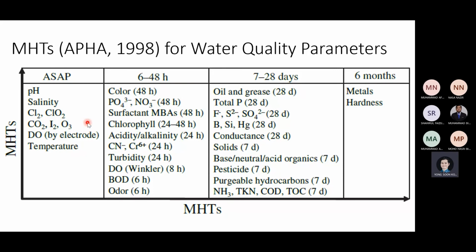They are like Wi-Fi. You can get the result directly from your phone nowadays. You put the probe inside the water, and your phone starts logging. Your phone can now be used as a data logger. Don't be surprised nowadays. And there are some other samples that you can wait on, but you have to remember some of them cannot wait too long.